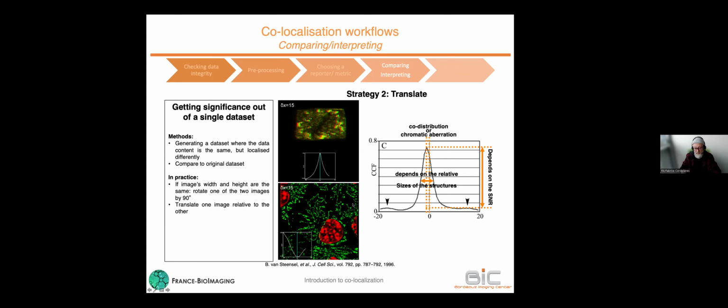To the opposite, if I've got two signals that are excluded, one excluded from the other, the correlation is minimal when I've got no displacement, but as the mitochondria are entering into the nuclear domain, I have some correlation in both directions. So this is another way to say, okay, look, my coefficient might be low, but it is specific.